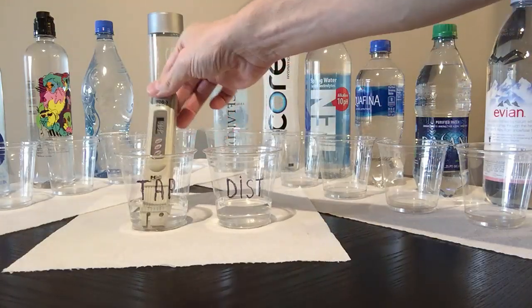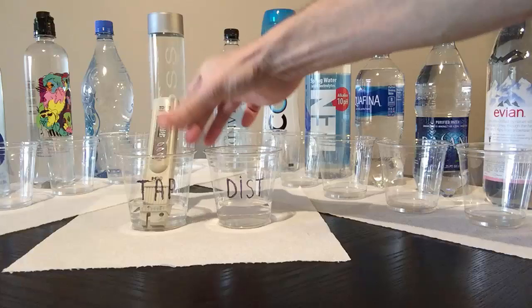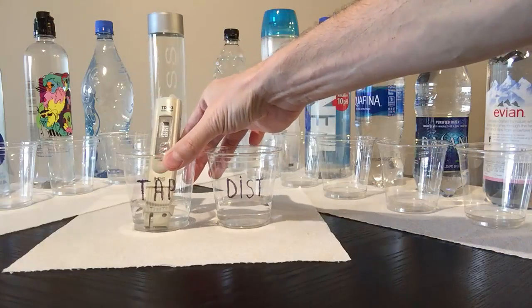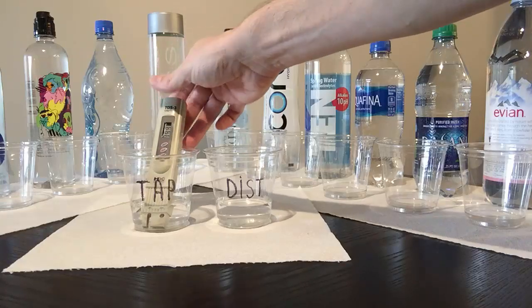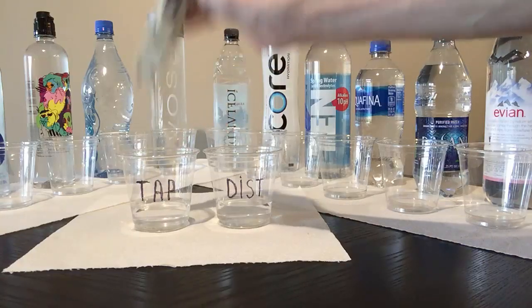Now let's compare it to tap water in Florida, and it shows about 199. So now you see the difference between distilled water and tap water — about 200 points.